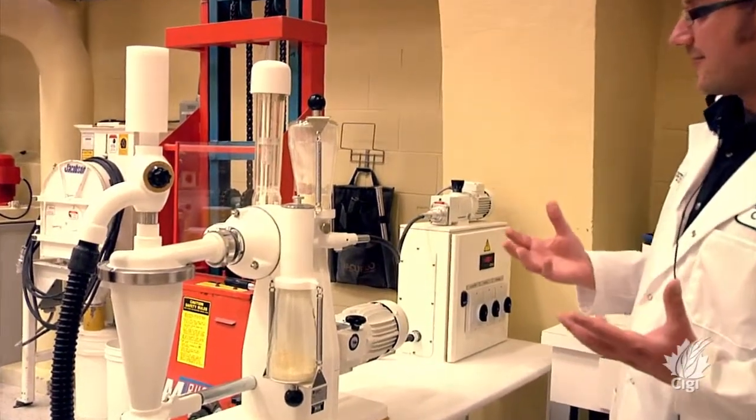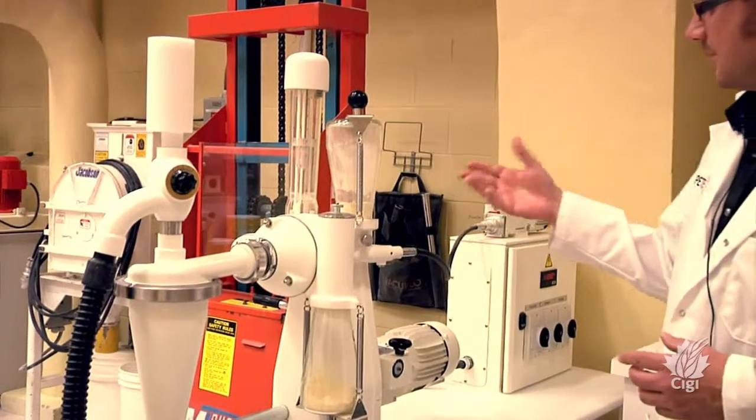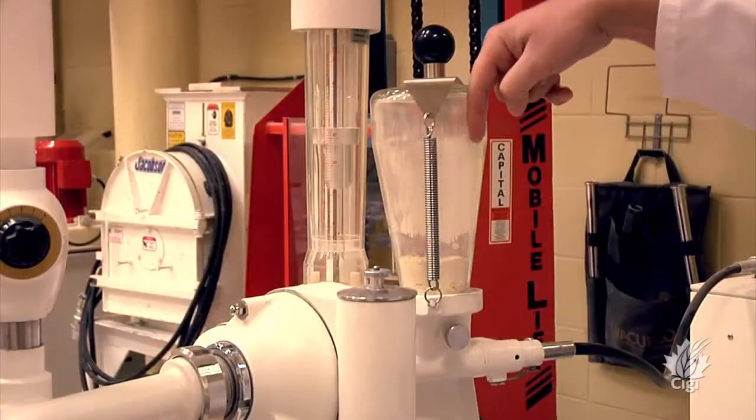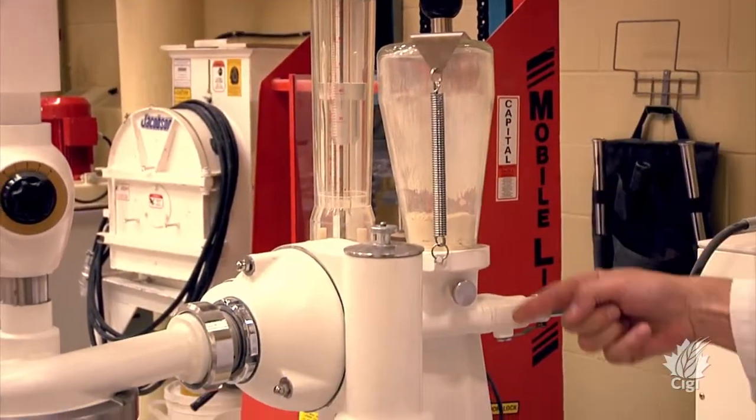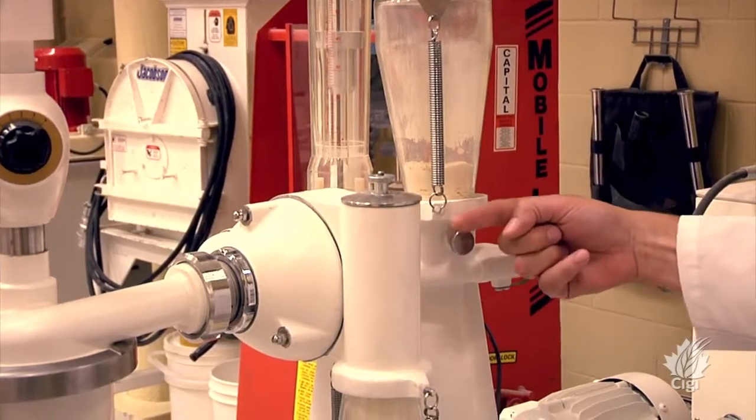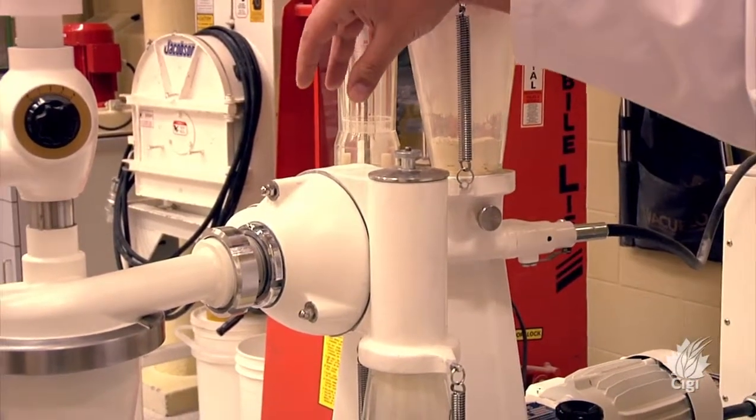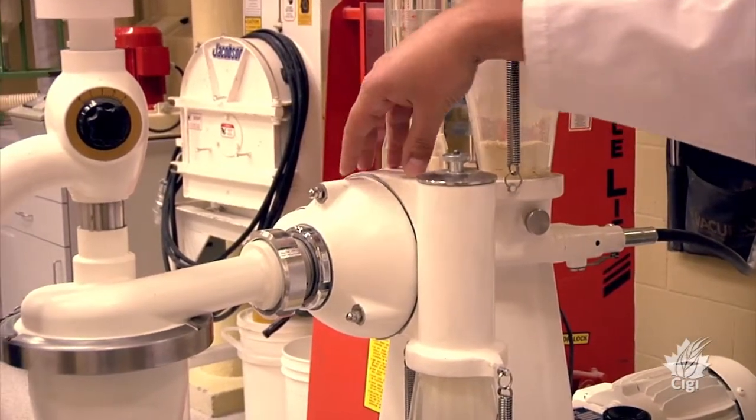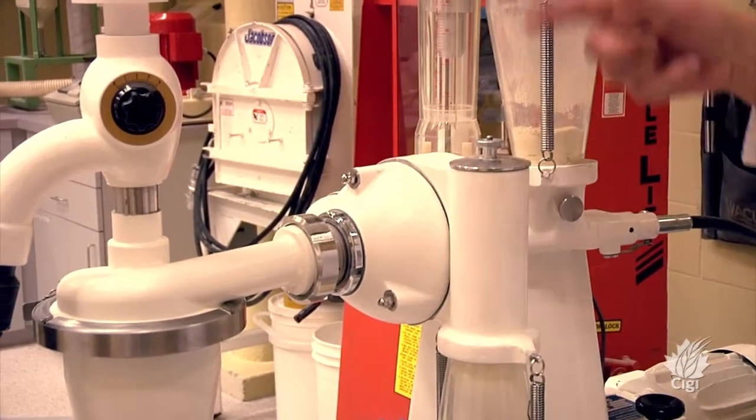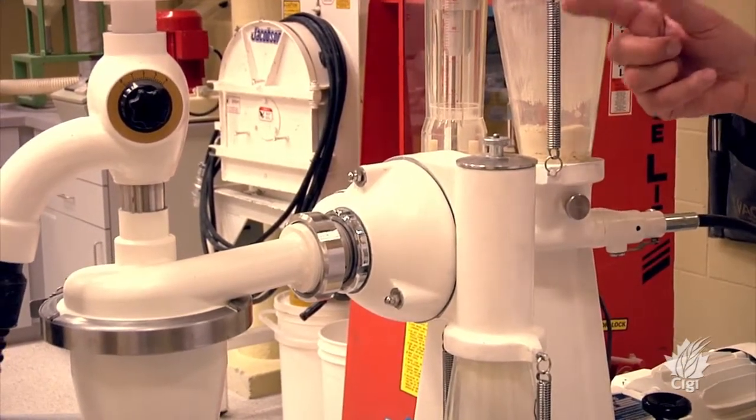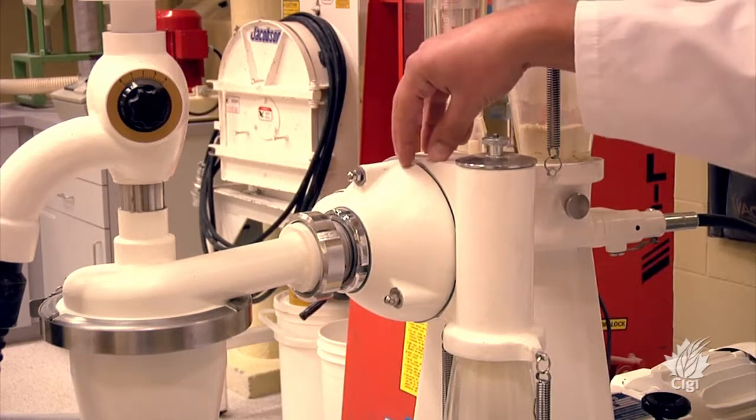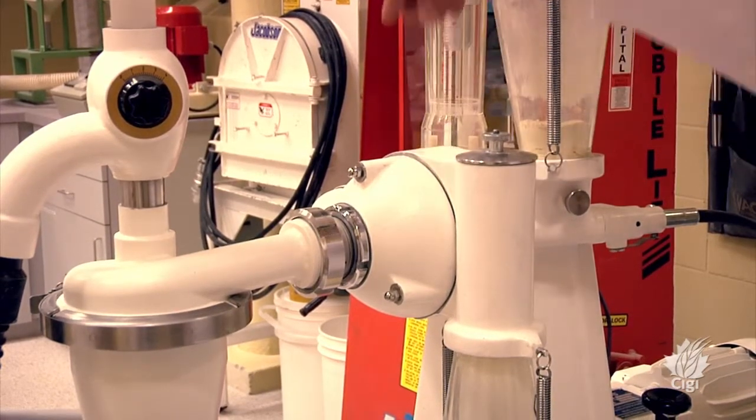I take my flour—in this case we have split pea flour. It is fed through by a rotating screw and it's introduced into this chamber here. There is a rotating wheel, it's called the classifier wheel, inside here as well as air flow.